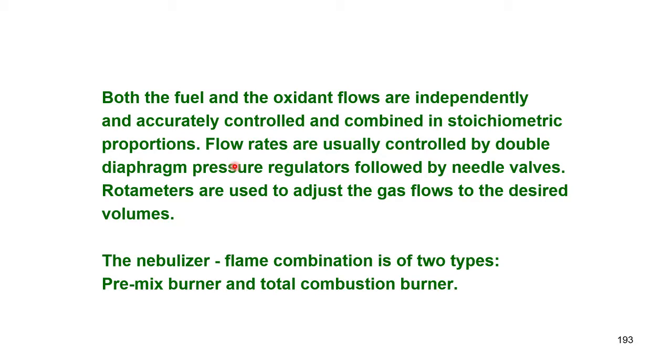Before I proceed to the next slide, I want you to understand that the nebulizer is the heart of the atomic absorption spectrometer. You have to make suction of the sample into the flame. Now, the optimum nebulizers convert about 20% of the liquid into spray normally.